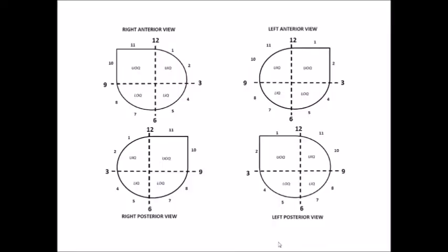A little background before we get started on the tutorial. Please understand that depending on how you orient the mastectomy and depending on the laterality of the specimen, will change the clock face position. We have 4 clock faces here demonstrating the different orientations and the different lateralities. So please take note of that.